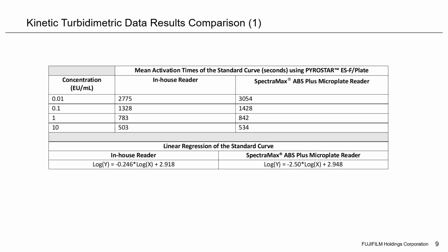Now, we'll get to the measure of validity in a moment in the specifications that USP 85 requires of a valid standard curve. But I do want you to notice at the offset here, we are getting slightly different values for activation time. Now, you'll notice I haven't mentioned any specific requirement for activation time, and the reason that's the case is because there are so many variables that can affect activation time, but are accounted for by the production of a standard curve.